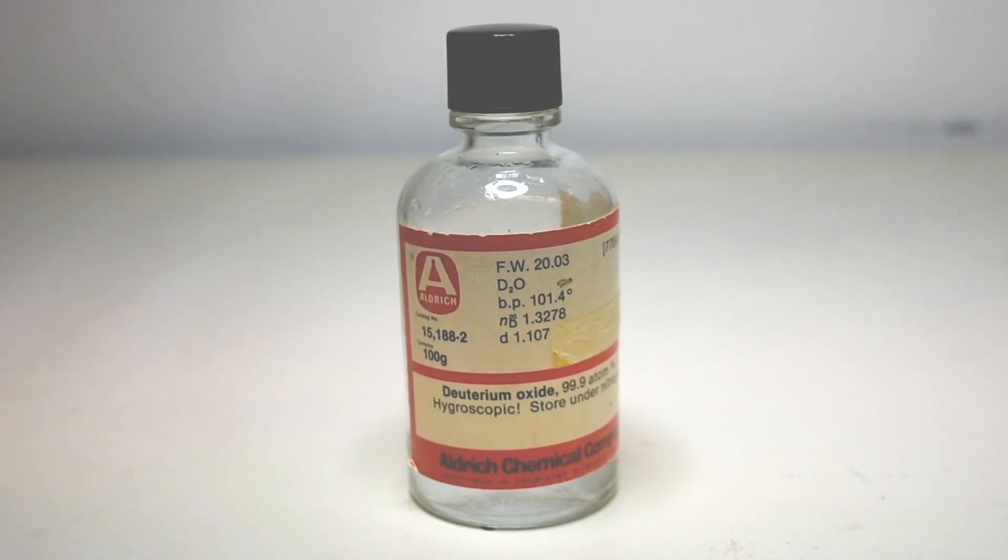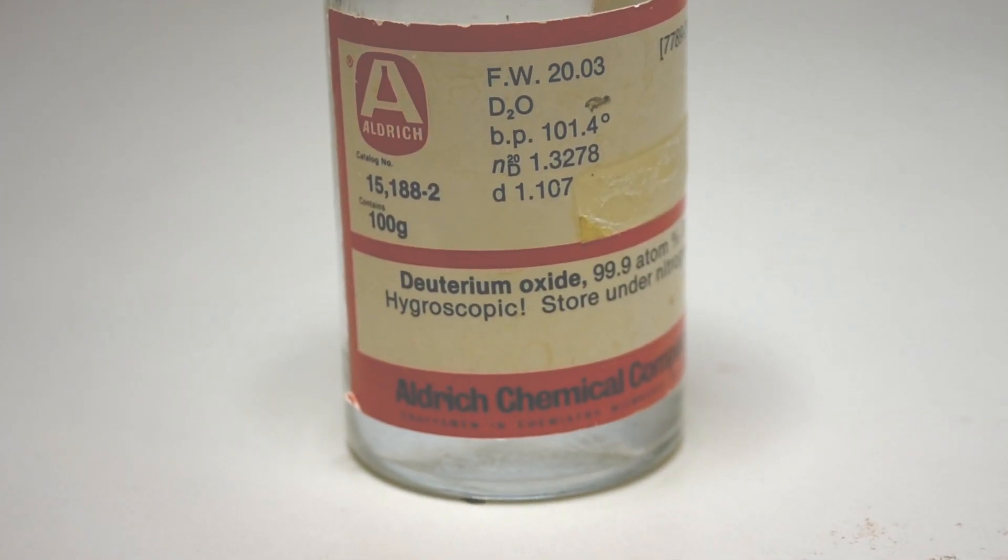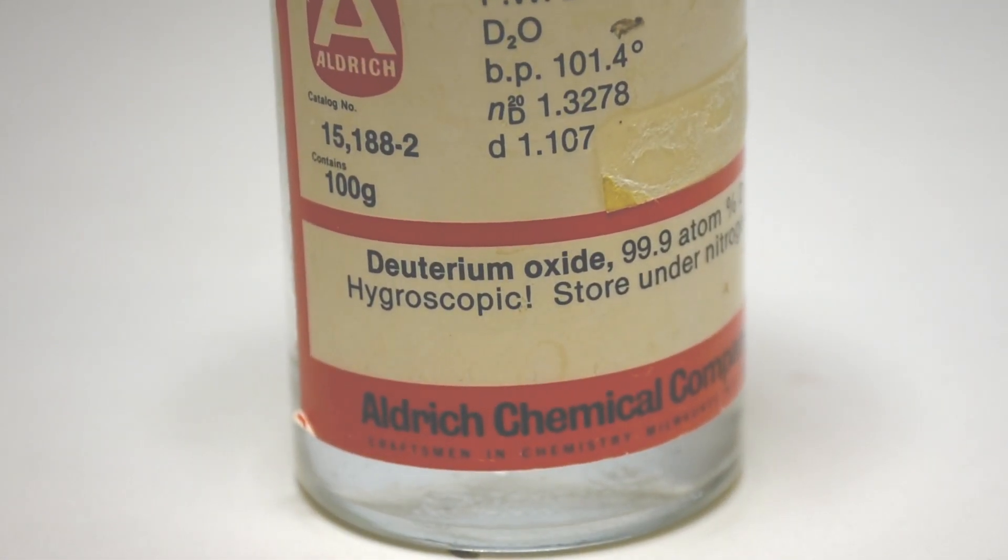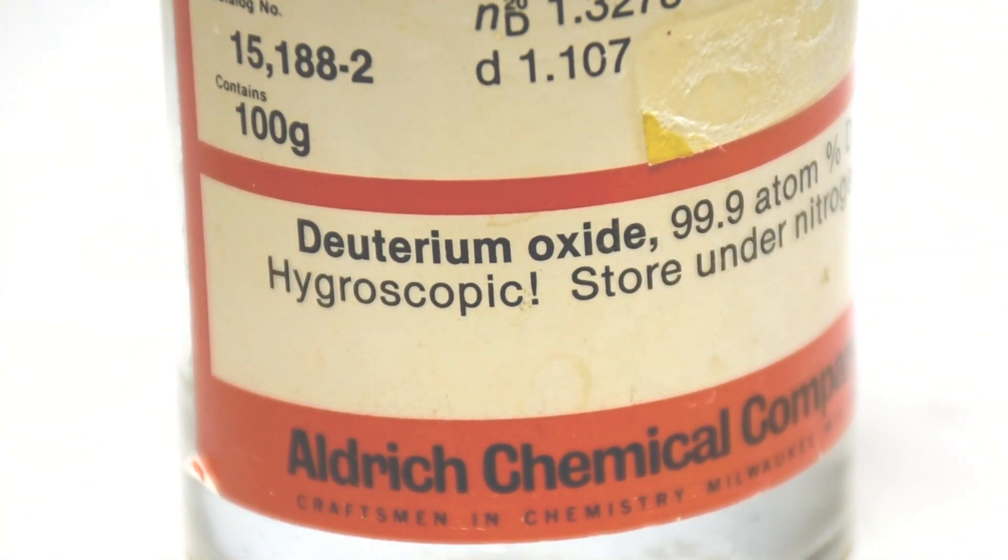The magnetic susceptibility of a material determines whether it will be attracted or repelled by a magnet. Diamagnetic materials are weakly repelled while paramagnetic materials are weakly attracted to a magnet.